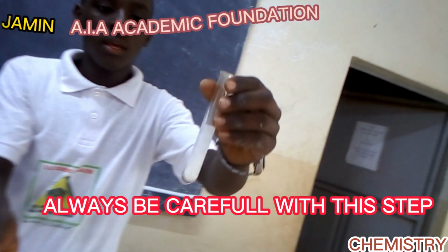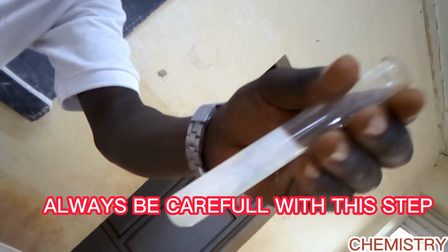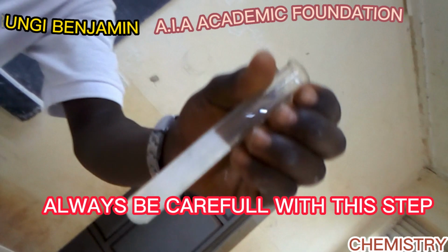So when they say until the solution is just acidic, it means we are going to add dilute nitric acid until these precipitates disappear and the solution becomes just colorless.